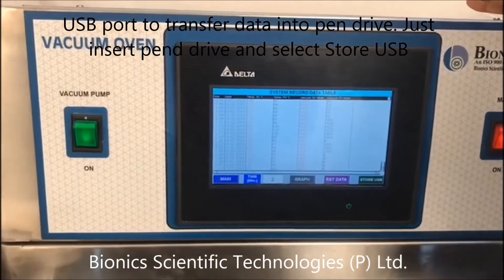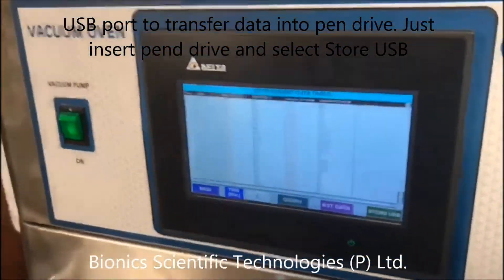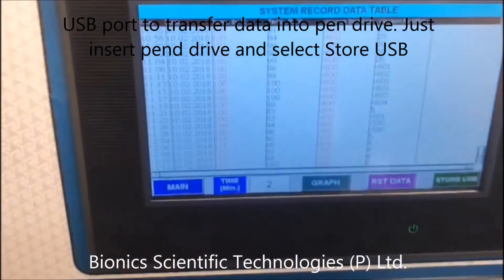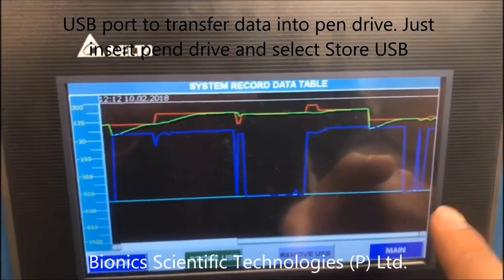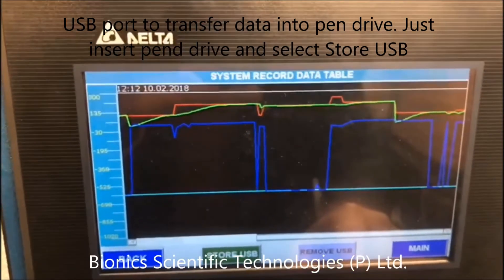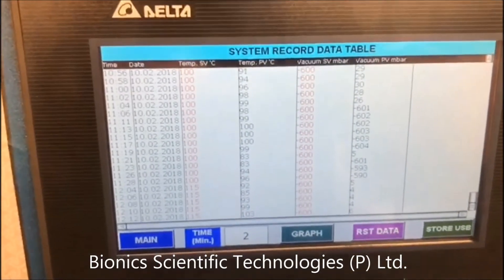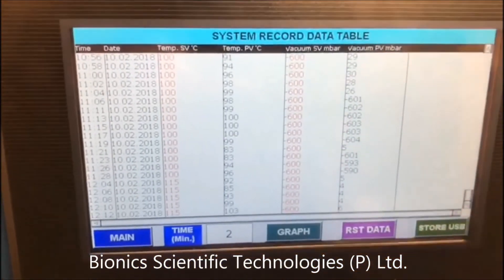So if you need the graph of it, if you need to put your pen drive over here, and then what you will do is — you can see here the graph. Store USB. As we are not here with the pen drive, so it is showing that your data has been stored. Same goes with this store USB — the same thing, it is showing fail because we are not here available with a pen drive.